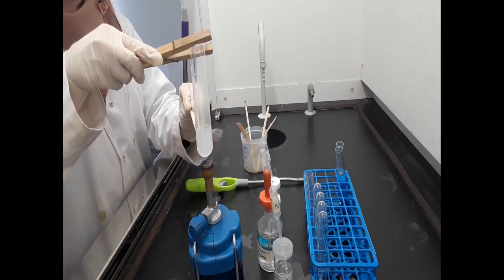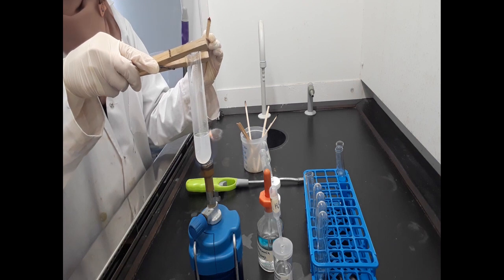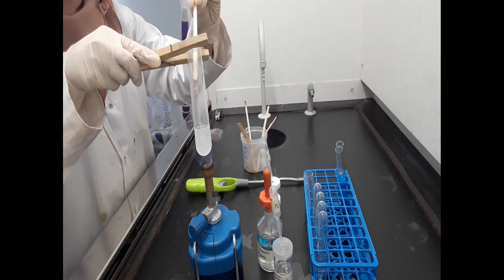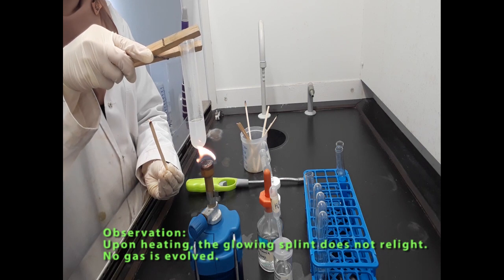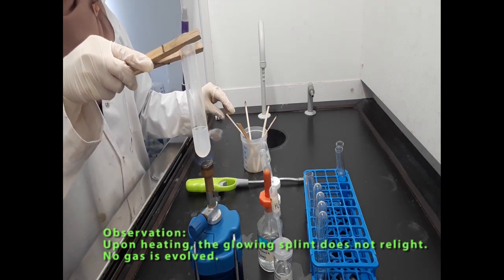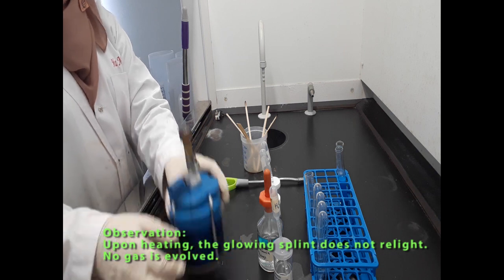Now prepare a glowing splint. It does not relight the glowing splint. Thus, for our observation, we write upon heating, it does not relight the glowing splint. Thus, no gas was evolved.